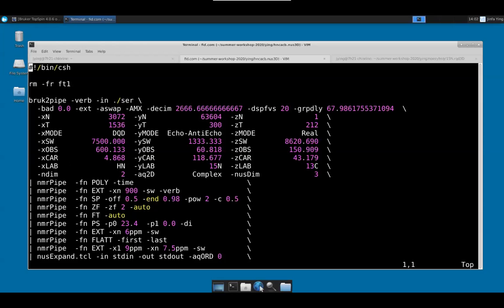This means that the whole data set is 3-dimensional, but you don't need that information. This program will figure it out as 3D. After this, we treat the whole thing as a 2D regardless of the dimensionality of the input data. We always treat it as 2D and just convert it.